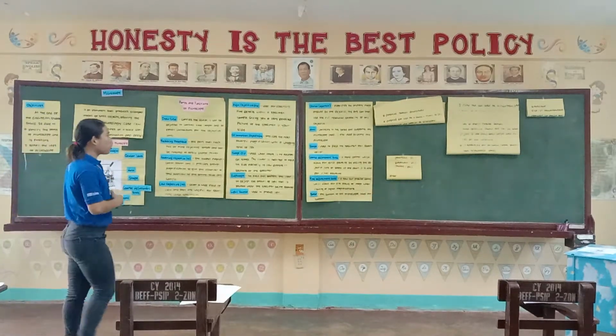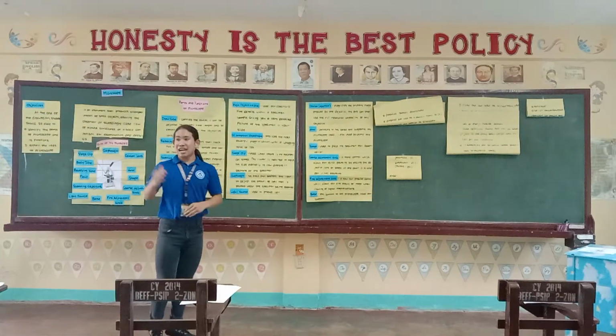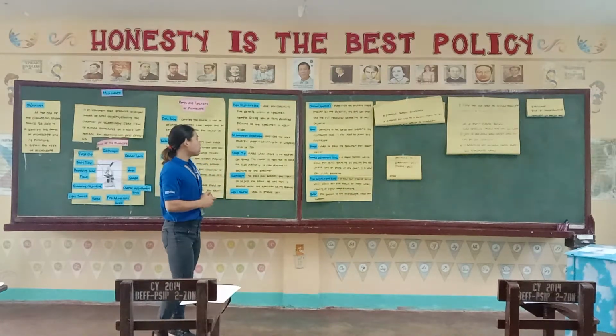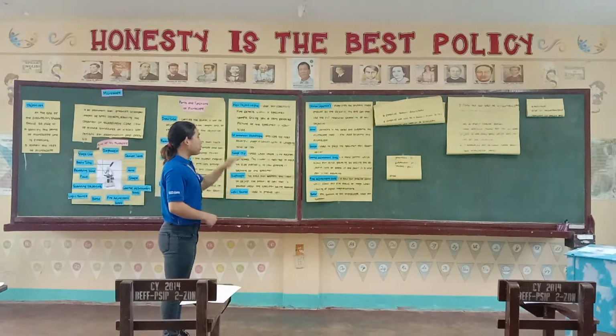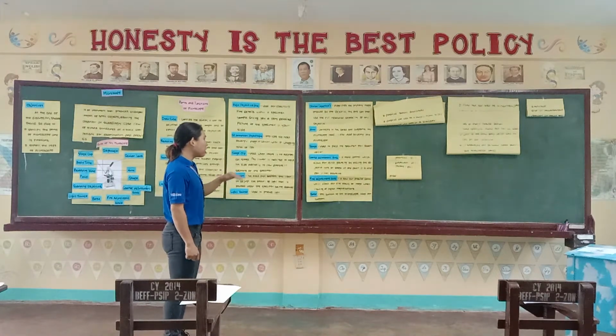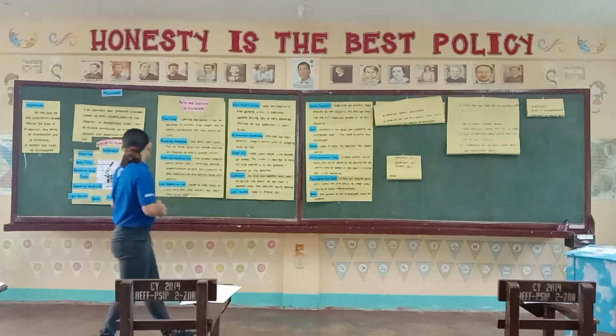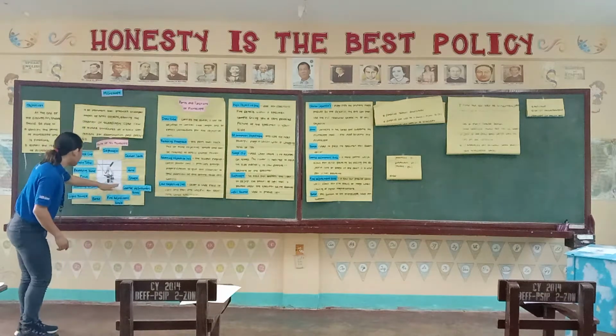So now let's move on to coarse adjustment na. Mr. Daga, please read. Okay, thank you. Take your seat. So a coarse adjustment knob is a rapid control which allows for quick focusing by moving the objective lens or stage up and down, used for initial focusing. So over here is the coarse adjustment knob.